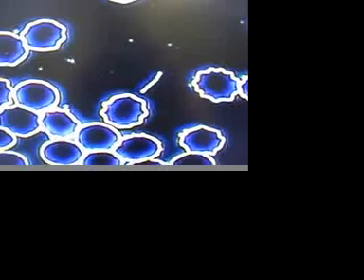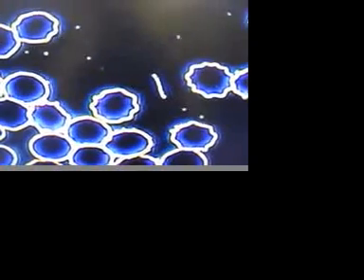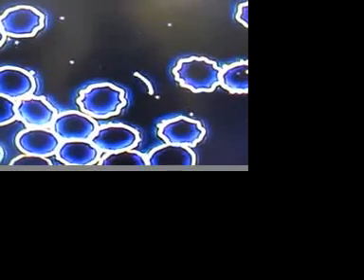By the time this picture was taken, the blood itself had been sitting on the slide for several hours, and you can see how a number of the cells are already dehydrated. We don't seem to see any inclusions in these cells, and that's a good thing. The inclusions, it seems, are related to the patient's health. The more inclusions, the worse the health of the patient.